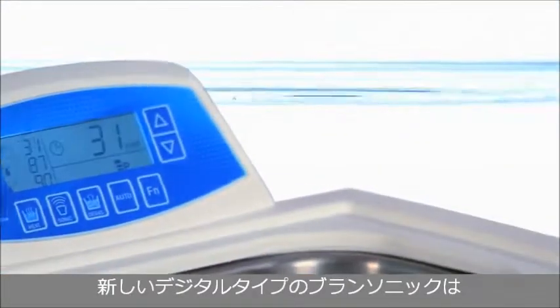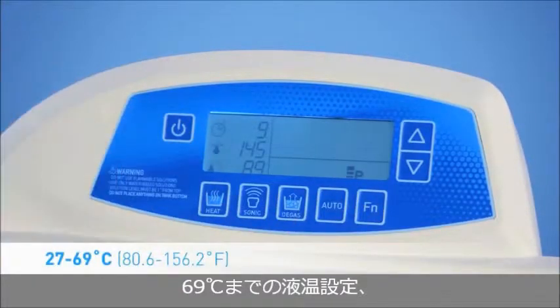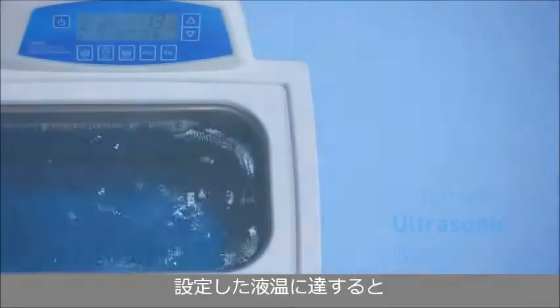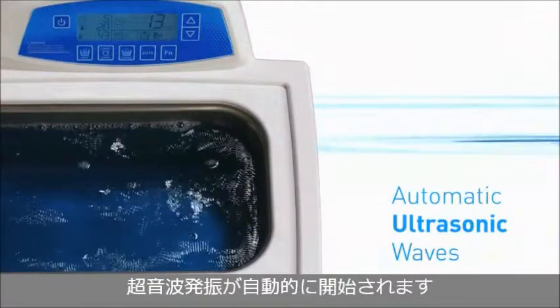The new digital series of Bransonic baths ensures the most consistency from batch to batch, with the ability to set temperatures from 27 to 69 degrees Celsius, or 80.6 to 156.2 degrees Fahrenheit. Once the programmed temperature is reached, the ultrasonic waves are automatically activated.